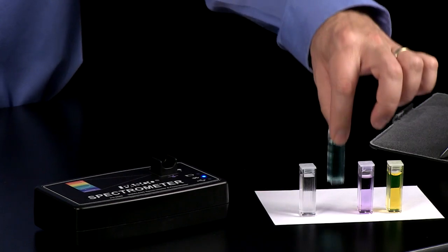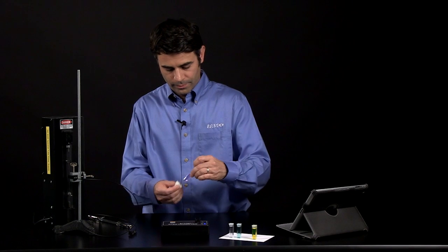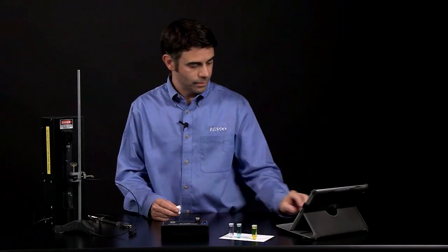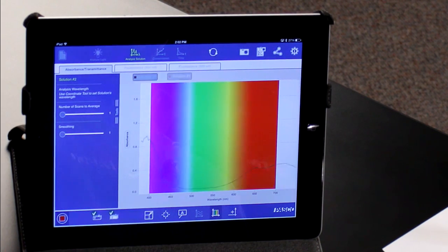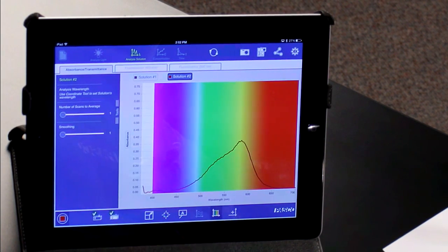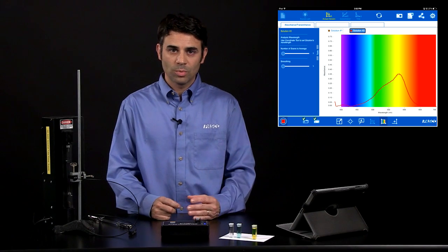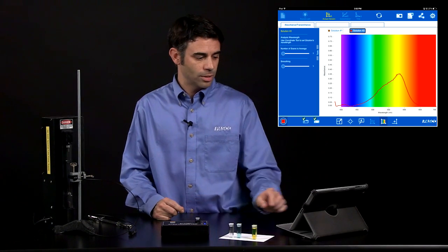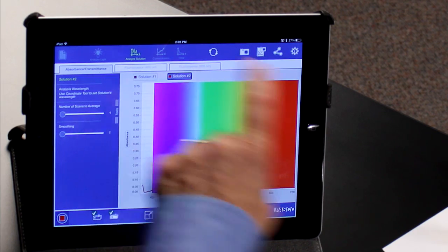We'll put another one in and start. And here is crystal violet. Now if you want to do more studies, which we'll show you in later videos, like concentration and time experiments, then you're going to want to set a wavelength to do those studies.